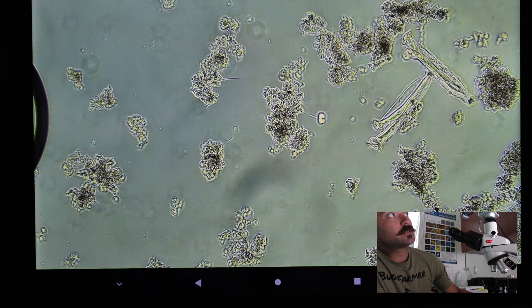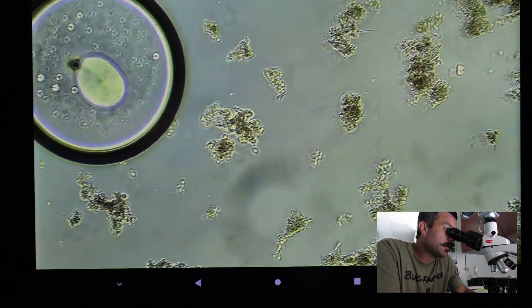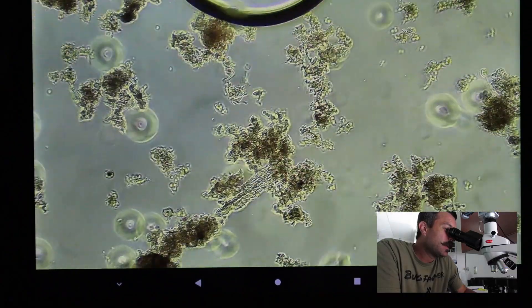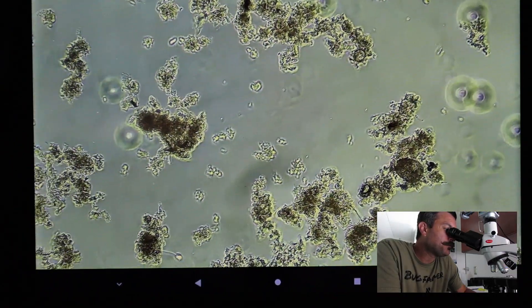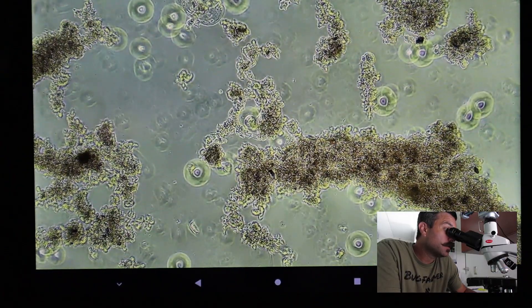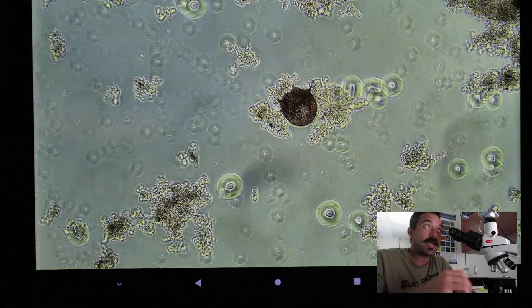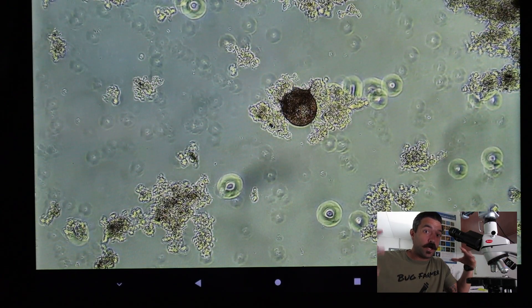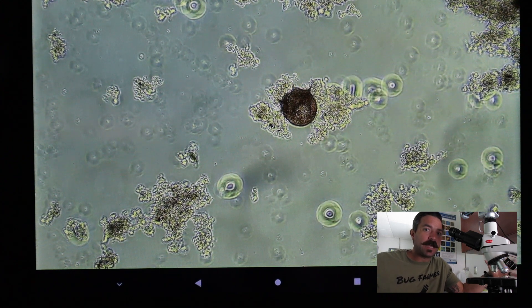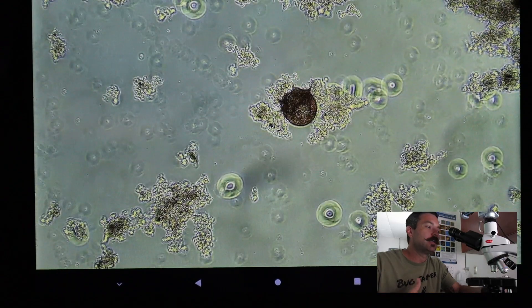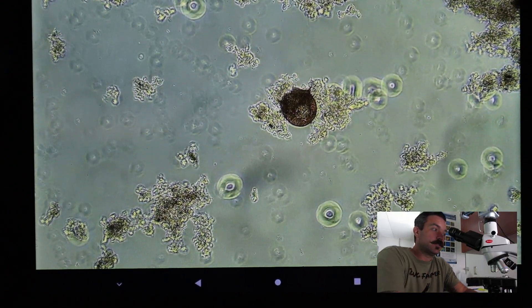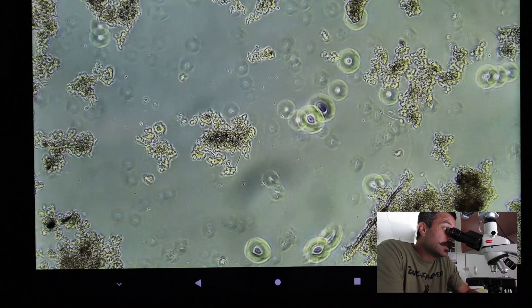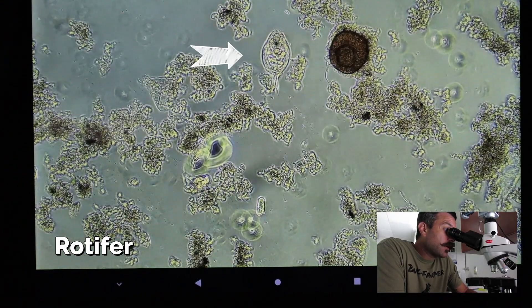More stalked ciliates in the sheath right there - great signs of life, meaning our process is more than likely doing well. We have seen a few worms and that's okay. Remember, this is just one drop of wastewater. Imagine this much microorganism activity in one drop, and you have hundreds of thousands if not millions of gallons at your plant constantly consuming the influent and reproducing all day.